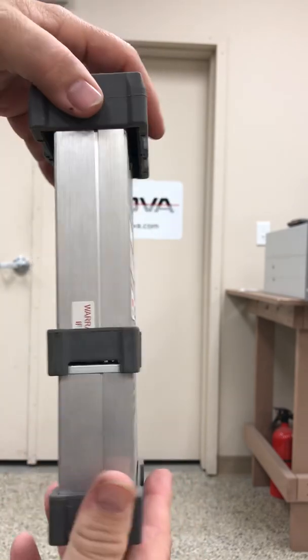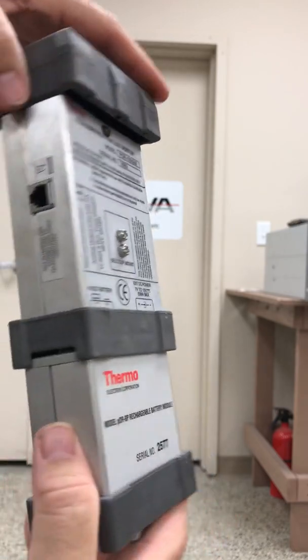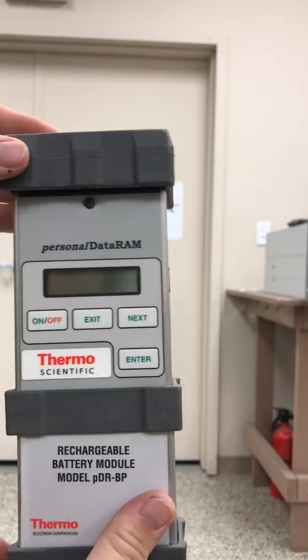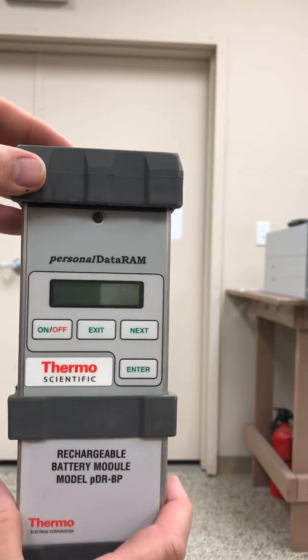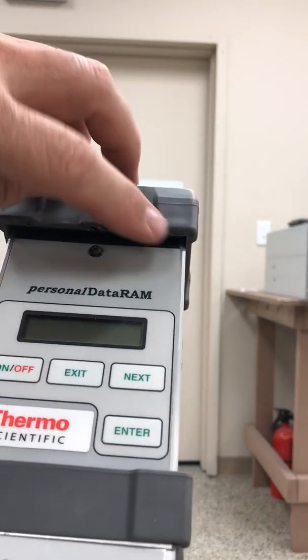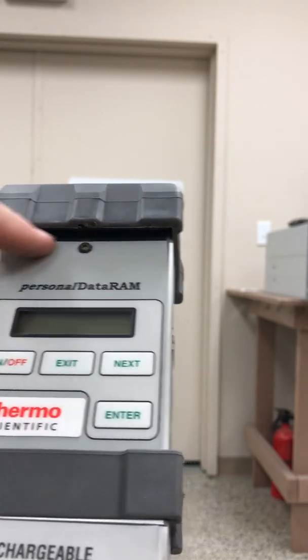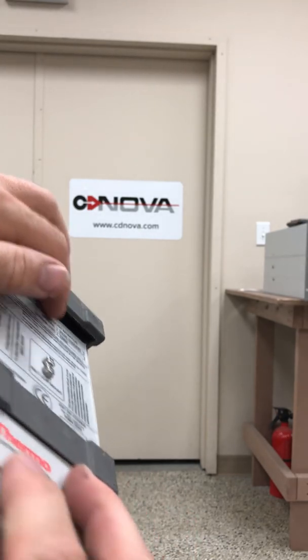This is just the front of the unit, side, back, and back to the other side and the front. This unit has a pump inside, measures particulate — it's a light scattering source. Air is simply pulled in through the top of this unit, just underneath this lip right here. There's an air intake on this side and another air intake on the other side right underneath here.